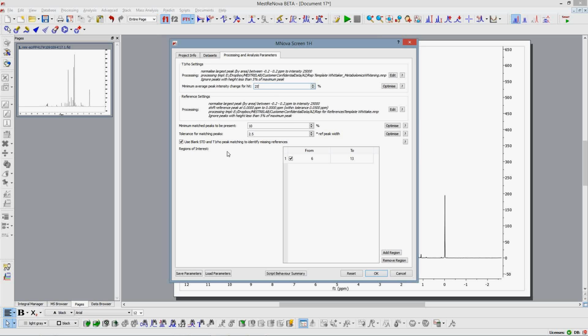Okay, now there is something that I didn't mention before, and it is when are we going to consider that one particular fragment has gone into solution or not.